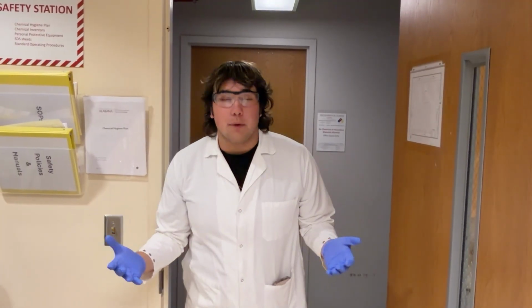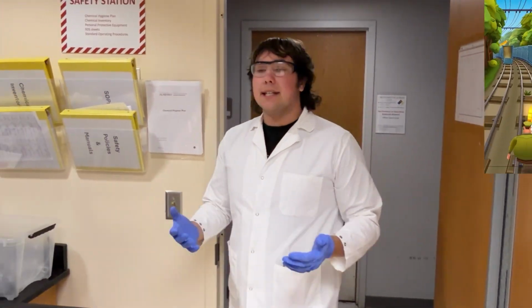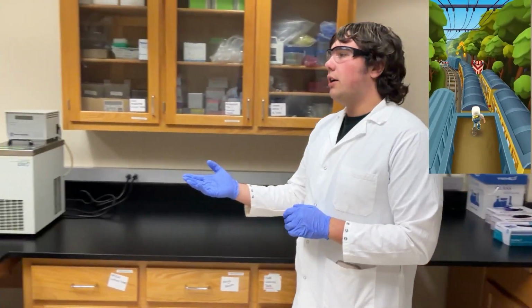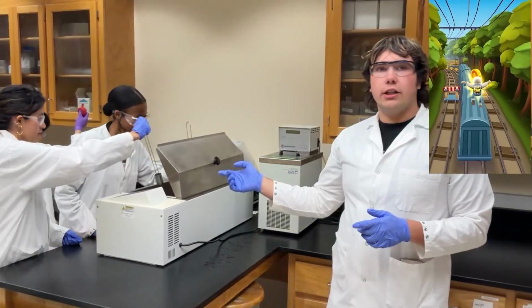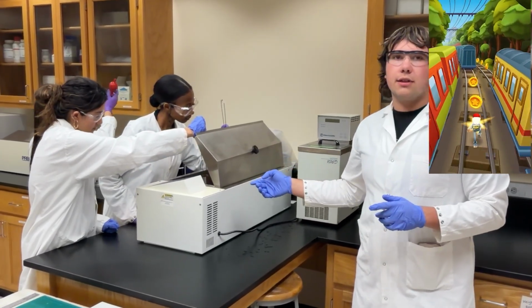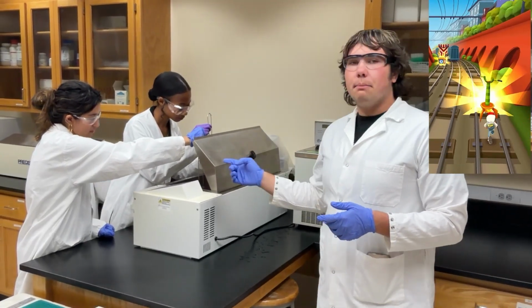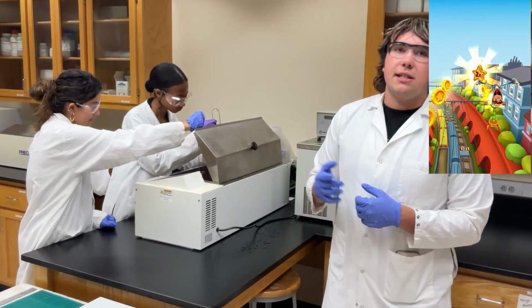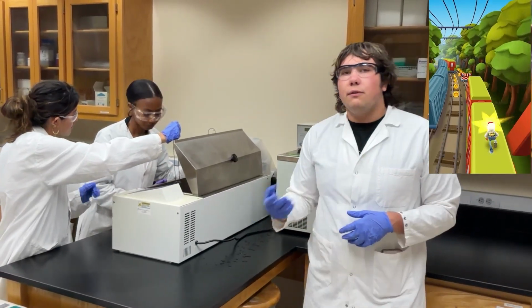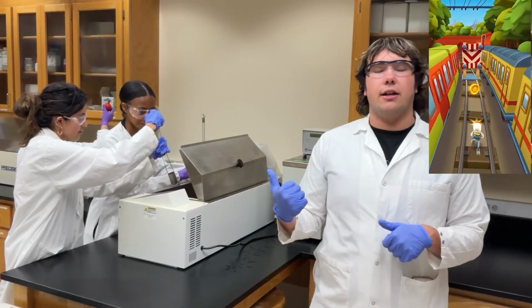First off, we're going to start off with experiment 1, the measuring of viscosities and densities of different oils at different temperatures. First off, we have our viscosity measurements using our Zahn cups at different oils in different temperatures. The oils are in water baths and they're at different temperatures. Remember, for the Zahn cups, specific ones work for specific trials better than others, so play around with the Zahn cups. If you used it previously in one trial, maybe redo that trial with a different Zahn cup so you can have it later down on the line.